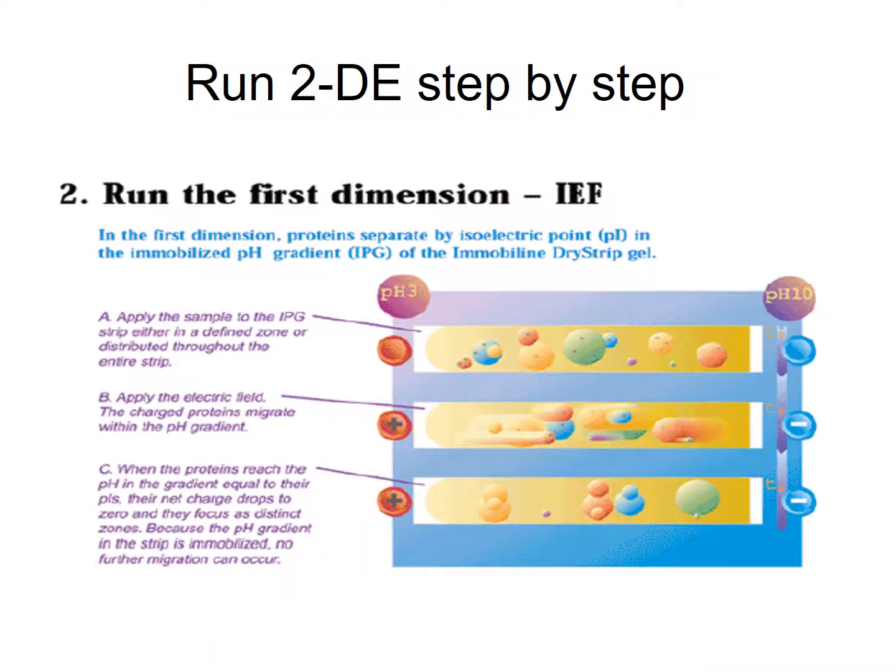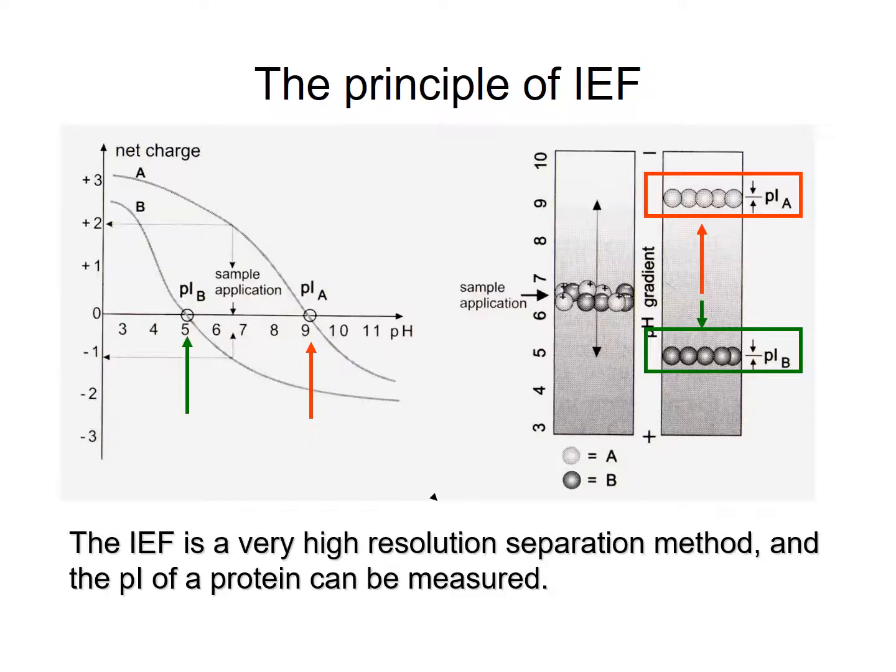And we're talking focusing, just showing the cartoon here, the different focusing, and we get the focused proteins lined up, and see the size difference here. It's like the Earth and the Moon kind of here, and so those line up, and then you apply here. So it's a good resolution method, and each protein can be measured, and now they have software that can predict.